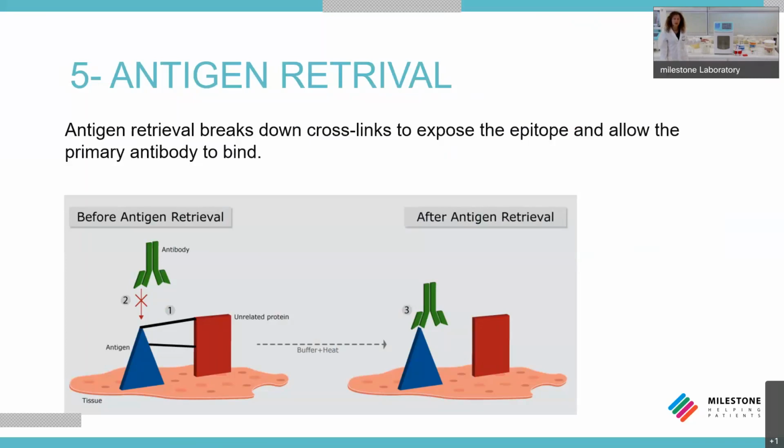The temperature achieved by the sources is a critical factor in the antigen retrieval process. In general, the higher the temperature of the antigen retrieval solution, the more effective is the recovery of the epitope. The steamer, water bath, and microwave usually produce temperatures in the 94 to 100 degrees range, while pressure cookers are capable of generating temperatures of 110 to 120 degrees.